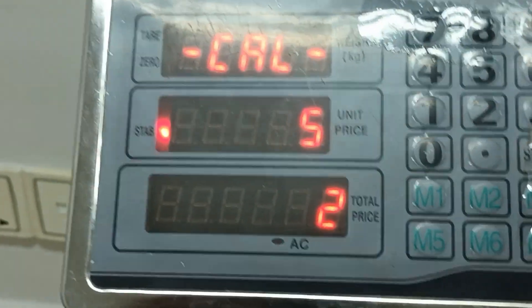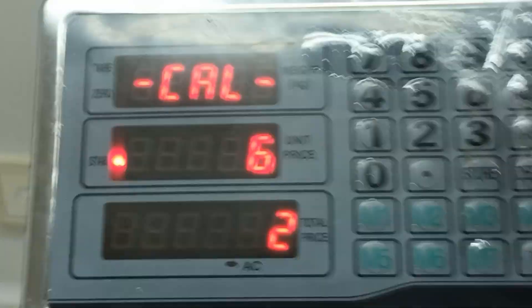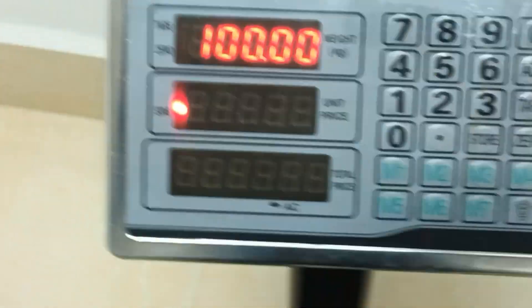Number four: I will choose to put just one hundred and press tare. Then number three, I will choose to put the number two and press the tare. It's okay — one hundred kg.